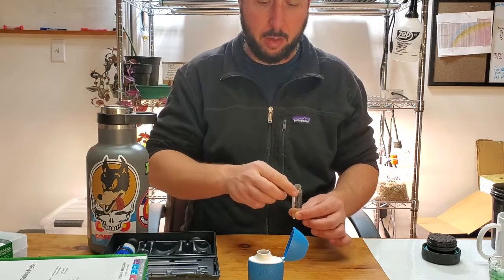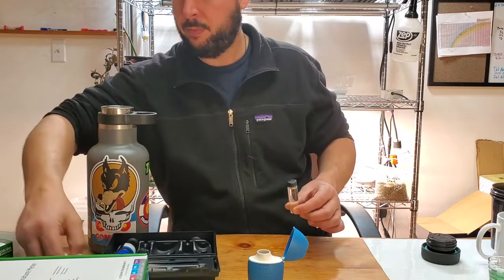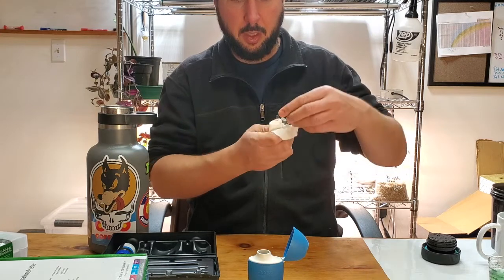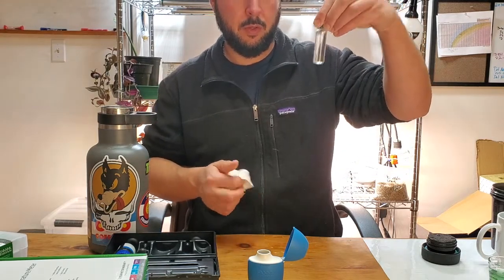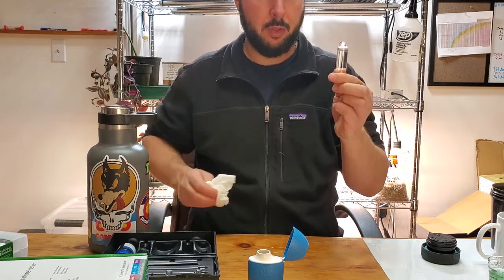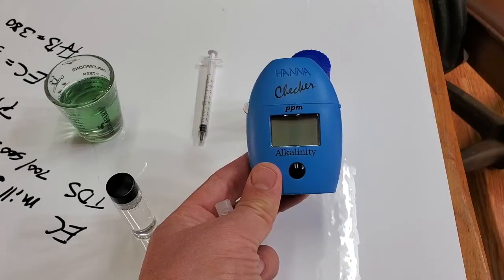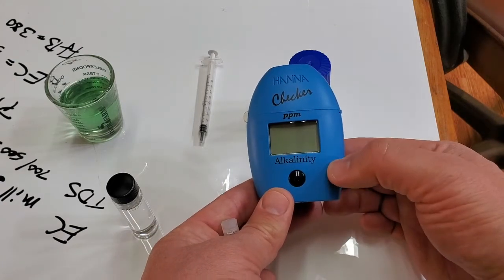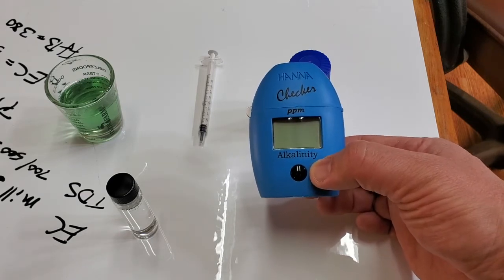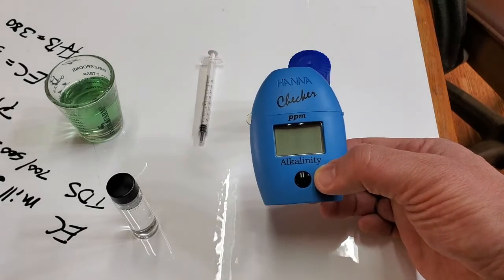It comes with two vials. You fill one with 10 milliliters of water. This checker is more for the aquarium market, but it's really important for hydroponics, especially for anybody running organics or no-till. It's really nice to know the alkalinity of the water going into your system.